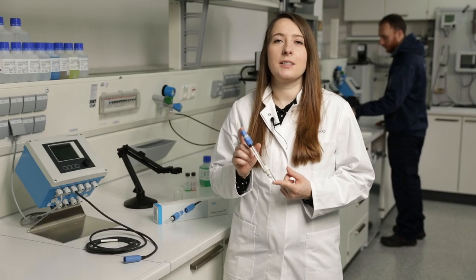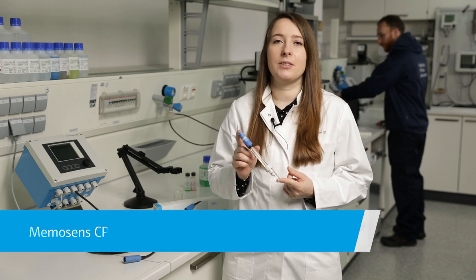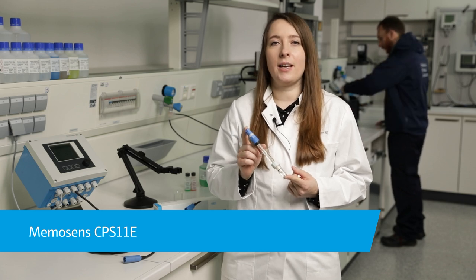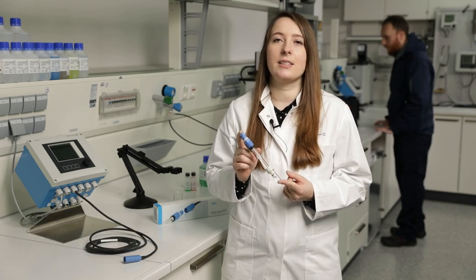A good example of this is the Memosense CPS11E with Memosense digital technology. This sensor type is easy to handle and needs no external KCL supply.